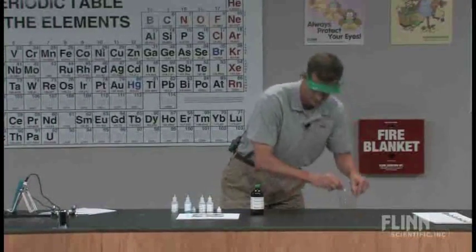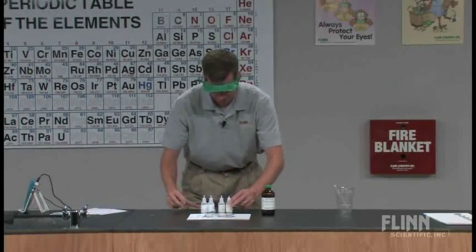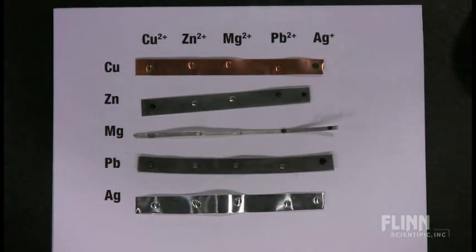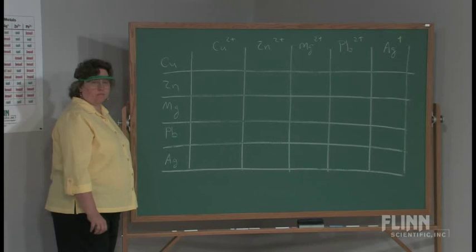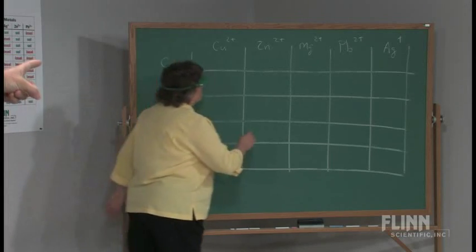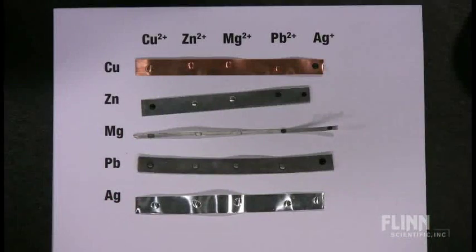I would like to try to make sure that these metals are all about the same length so we can show that. What I've noticed here is I've got some reactions already starting to take place. If we start to look on the piece of copper metal — I have an assistant here, Mary — Mary's going to help us put a little bit of data up on the board so we can see it. Really our data table is sitting right in front of us. In the first one with the copper, I've got one reaction with the silver ion all the way in the upper right-hand corner. We've got a yes in that data point — yes, we have a reaction taking place.